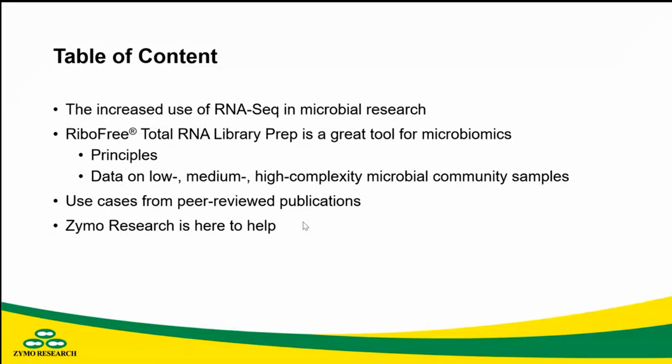Now, I'll briefly discuss the principles. So how does ribo-free work? And then more importantly, sharing with everyone some data on our internal challenging of the system to low, medium, and high complexity microbial community samples, which mimic how complicated microbiomic samples will look in real research. And following on will be some use cases that I believe speak louder, because they show how the community is applying this technology to all kinds of interesting, exciting research that has already been made public in peer-reviewed publications.